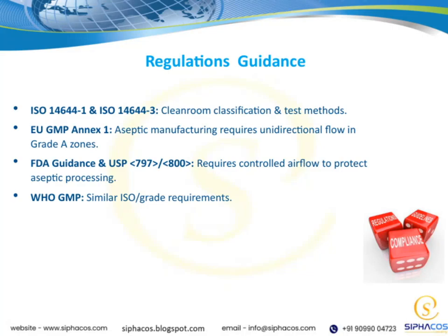Let's take a closer look at the key regulations and guidance that shape cleanroom standards. First, we have ISO 14644-1 and ISO 14644-3, which set the classification and testing methods for cleanrooms. These standards are essential for defining cleanroom cleanliness levels and ensuring they meet specific criteria through rigorous testing.